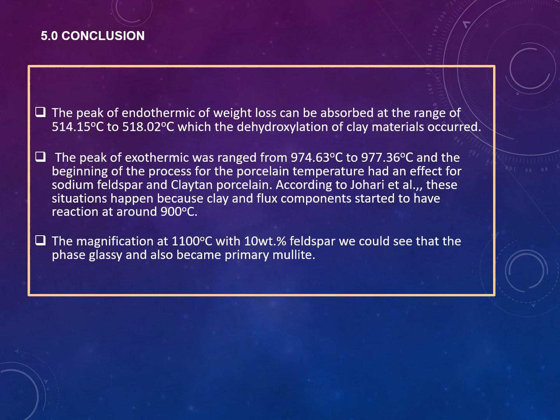Okay, this is the conclusion of my presentation. The endothermic peak of weight loss can be observed in the range of 514.15 degrees to 518.02 degrees, where the dehydroxylation of clay material occurs.